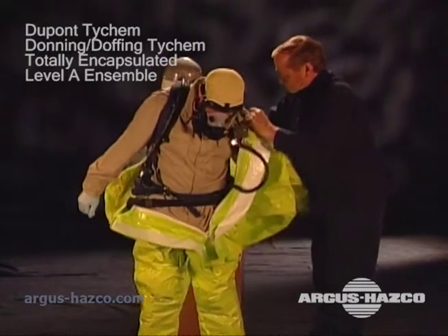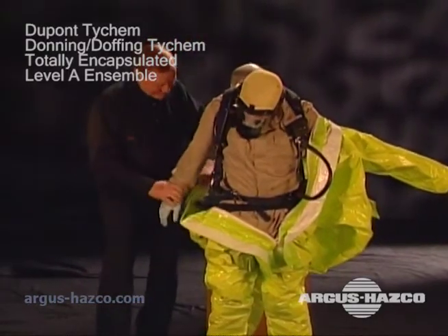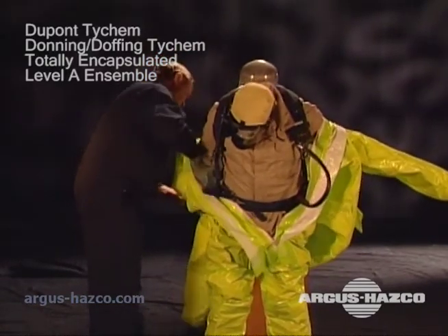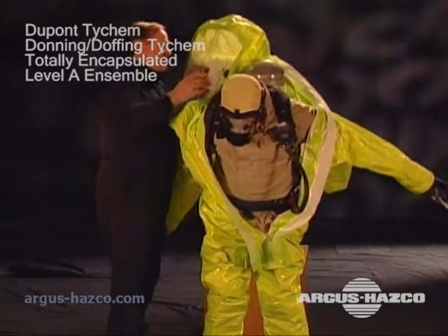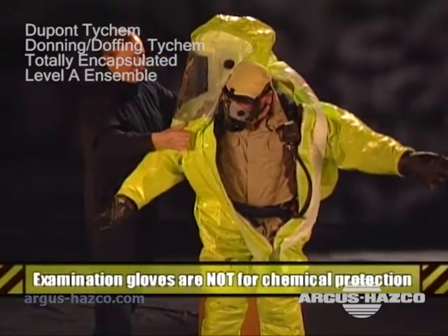Now put your arms into the sleeves. Level A suits usually come with several layers of attached gloves. Adjust your gloves to make sure the layers are properly aligned. Users often wear an additional cotton or examination glove against the skin to make it easier for the hand to slide in and out. These examination gloves are not intended for chemical protection.